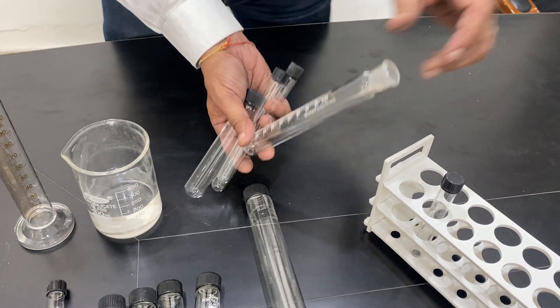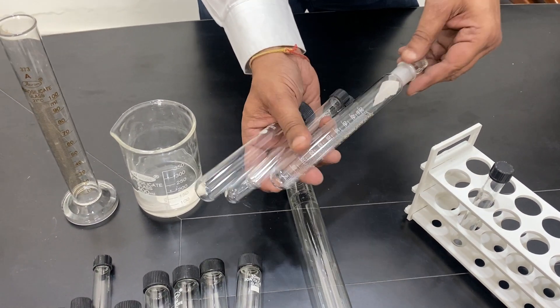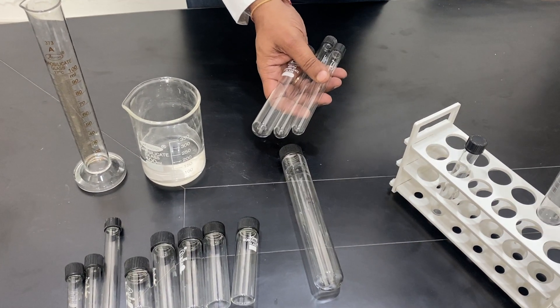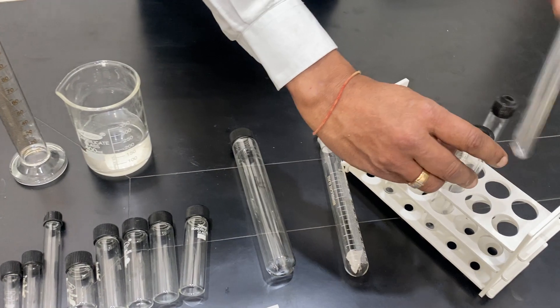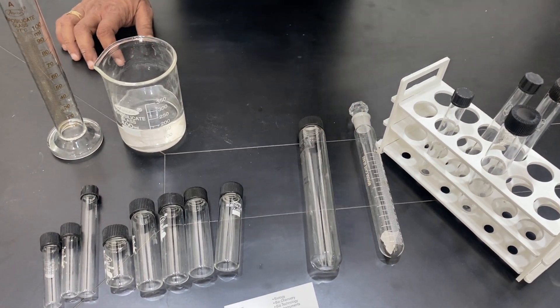There is a quick-fit mouth option, and you can also have a stopper — either a plastic stopper or glass stopper. These are another kind of culture tubes or tubes with a round bottom. You can place them only in a stand; they cannot stand on their own — you either have to lay them down or keep them in a stand.